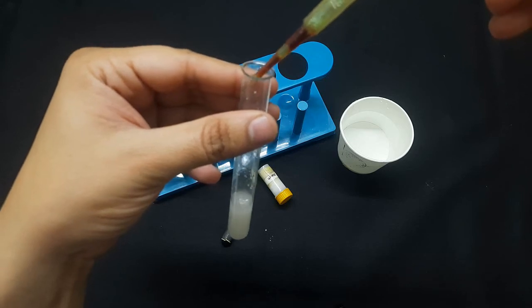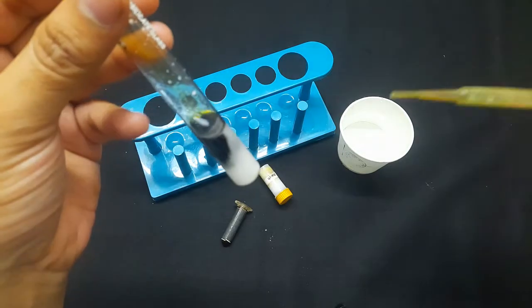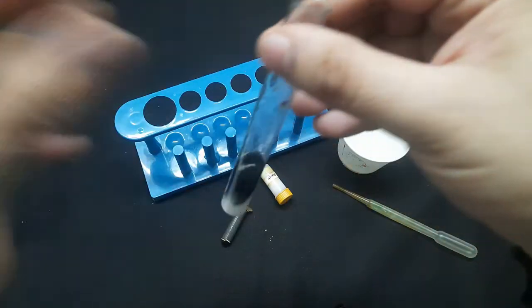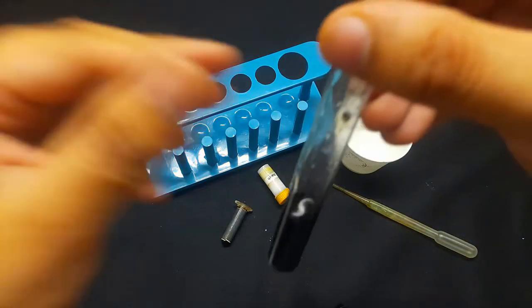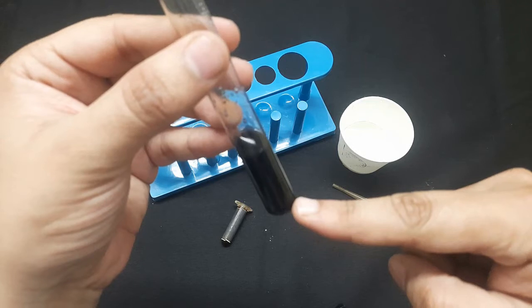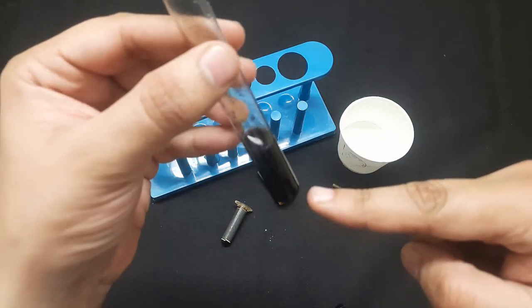So let me put 2 drops, and here you can see the color changes to black, and yes, it shows the presence of starch inside this test tube. So in this way we have done the test for the presence of starch in a food.